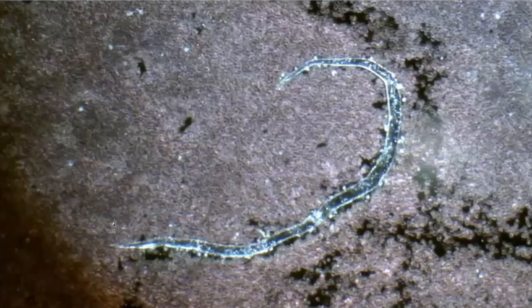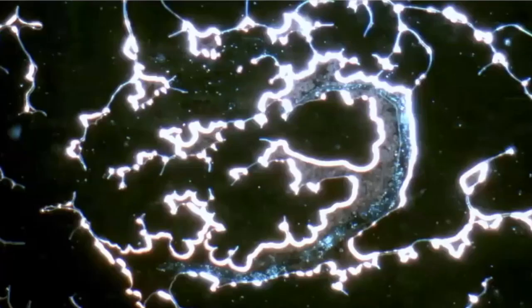So the other thing I wanted to show you, these structures that a lot of people are showing in the blood. When we dry the blood out, for example, I'm not talking about dried blood analysis. This is the sample. This is the same slide left for 24 hours. So the sample's dried out. You can see how it's all dried and it's created certain patterns.